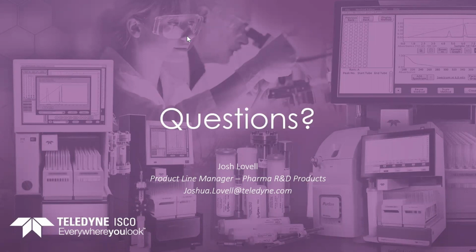Another question here is, does the Torrent system need to be grounded? So it does. It's grounded through the electrical ground of the power supply to the outlet. So that's one ground, and it does have a grounding location that you could ground to another ground point in your hood or on your bench. So you can do that. Usually we defer to what the local requirements are, but you're able to do that. But it is inherently grounded through the power supply also.